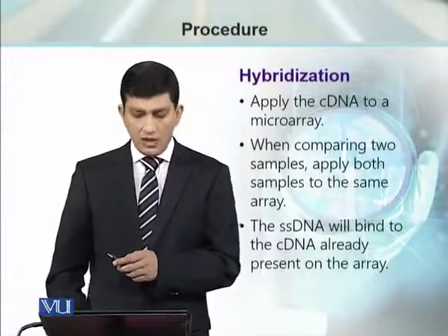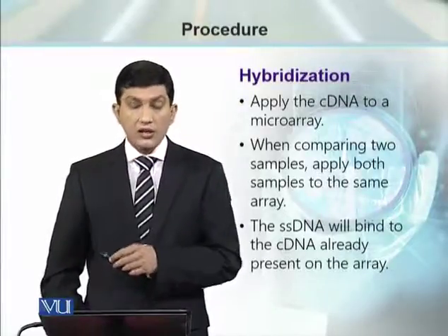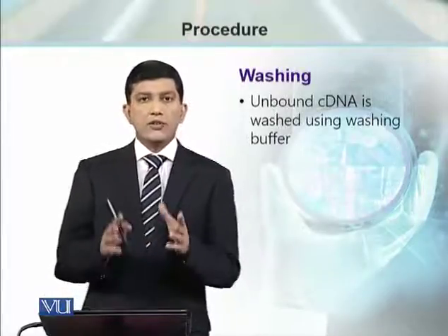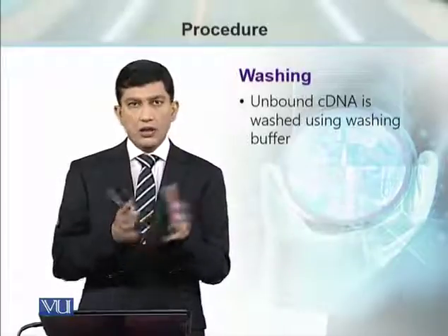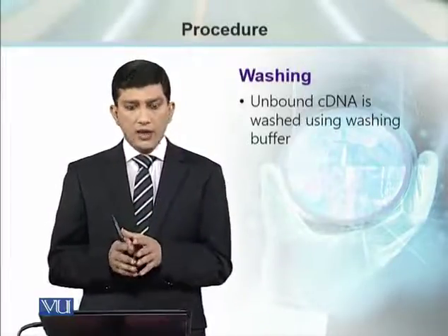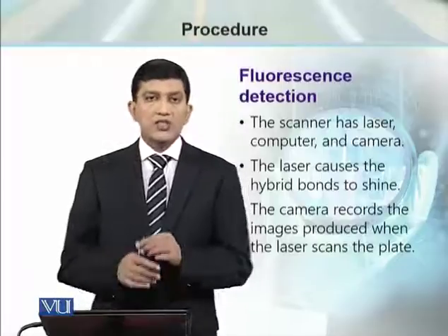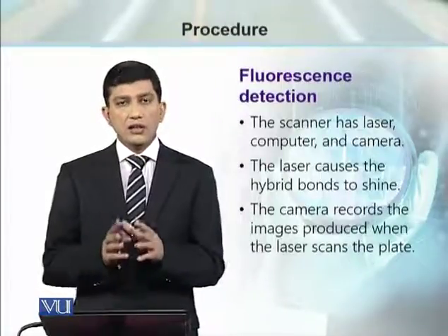Once this single strand DNA is going to hybridize with the cDNA, after the hybridization period, we are going to wash it, and then we are going to use the scanner for fluorescent detection.